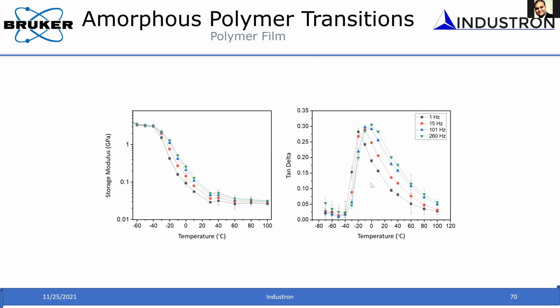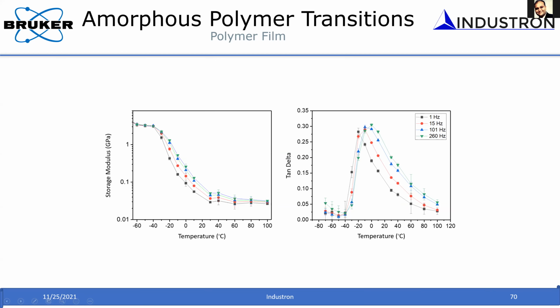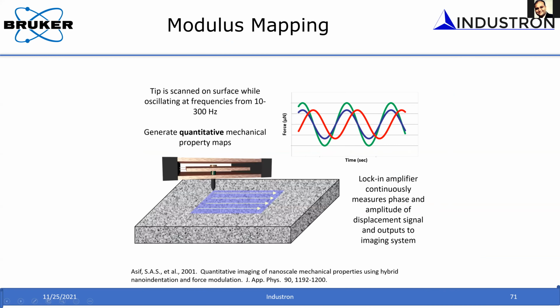Okay, so now we have a robust measurement technique where we can measure the viscoelastic response. Can we extend this technique for imaging as well? For example, in the first webinar, I presented a way to measure the surface morphology of the specimen that you wanted to indent by a scanning technique, where we just measure the topography of the surface. Now, because we can apply the dynamic load along with the topography, you can also measure the dynamic response as you scan on the surface.